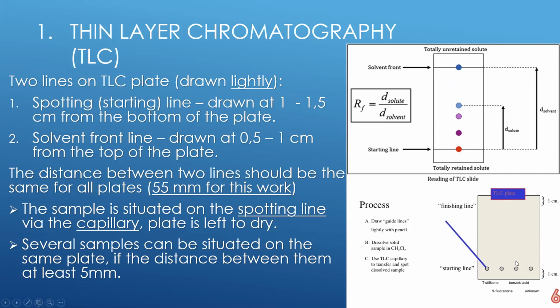Several samples also could be applied to the starting line. For example, in the top picture we can see only one sample at the starting line. In the bottom picture we can see 4 samples. And in this work we also use several samples, to be exact 4 different samples.